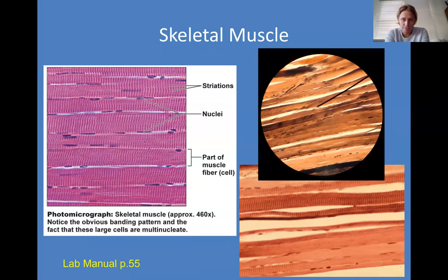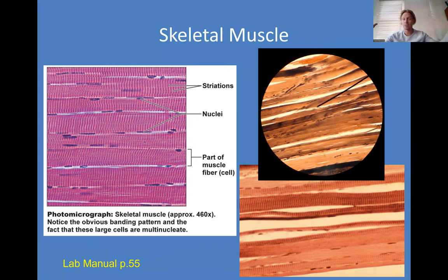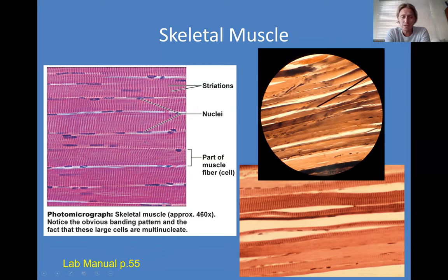Skeletal muscle is probably one of the easiest tissues to identify because the cells look so different than anything else. This is a single muscle cell right here. They are very, very long — much longer than most other cells in your body. They also have striations: those are lines of proteins inside the cell used for contraction. Those proteins contract and actually shrink the cell in length. Skeletal muscle cells are really long and tube-like, so we sometimes refer to them as muscle fibers. The term muscle fiber refers to a single skeletal muscle cell.